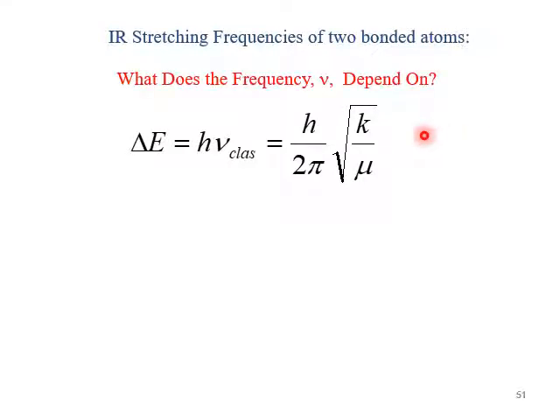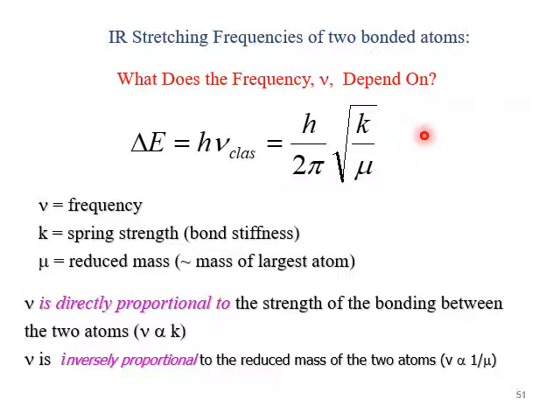So what does frequency depend on? If you look at each individual molecule, you can actually treat them as springs. If you remember from physics class, you have your spring constant, which is from Hooke's law, right? F equals kx, where k is the ratio between the force applied and the distance traveled by a spring. So we can simplify the model by thinking of atoms as springs. So frequency actually depends on that k constant and mass.